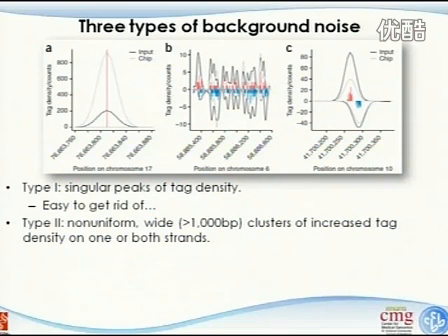And the third type, which is really difficult to get rid of, is where the reads look very much like a real peak. If you have a good eye, you can see a faint line here, which is the ChIP enriched sample. You can see this is almost identical, a perfect example of what we saw in previous slides.